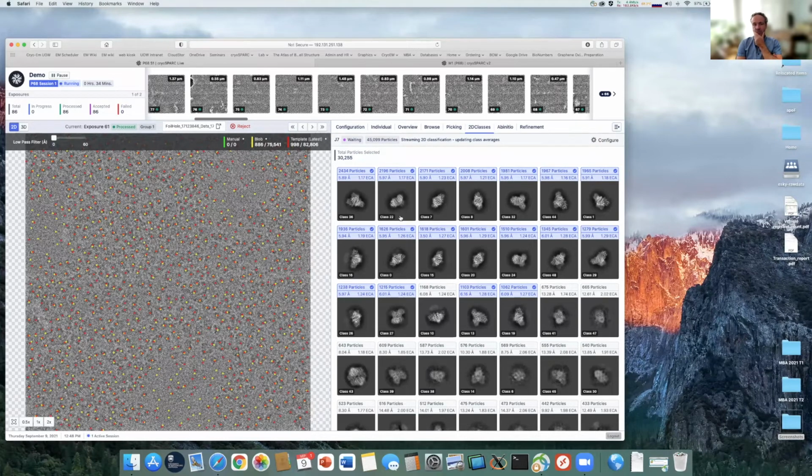My viewpoint on Live is that this is really to make a decision. From the refinement, we can decide, is subunit beta 2, or whatever you're looking for, there? For example, we were looking at proteins bound to Fabs, just earlier this week, and we wanted to find out, was the Fab there?